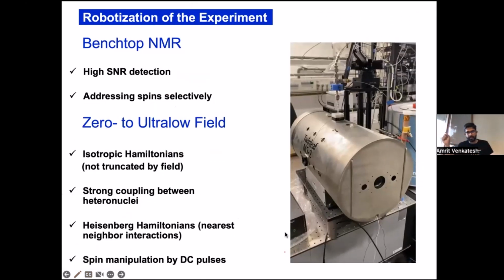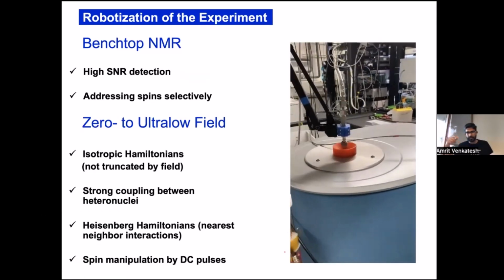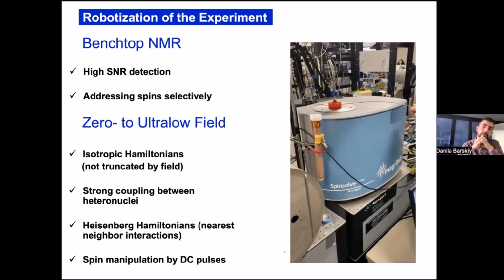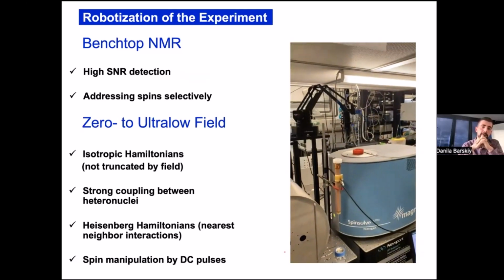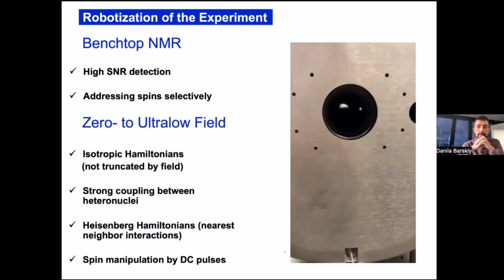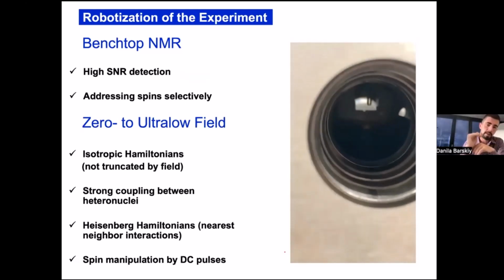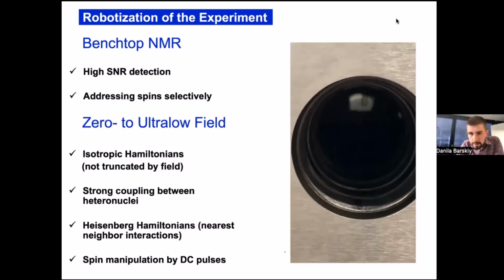Is the NMR signal that you obtain quite reproducible, to do some complex experiments with the benchtop as well? That's our goal: 2D experiments, 2D correlations, zero to high field NMR correlations, and HSQC, HMBC type of information, so correlation between N15 and hydrogen. It's a goal. We are not there yet. It's not, I think, fundamentally impossible. It's just, again, practical challenges. Indeed, you want to be robust, and there are practical problems associated with that, for example, with your solvent.